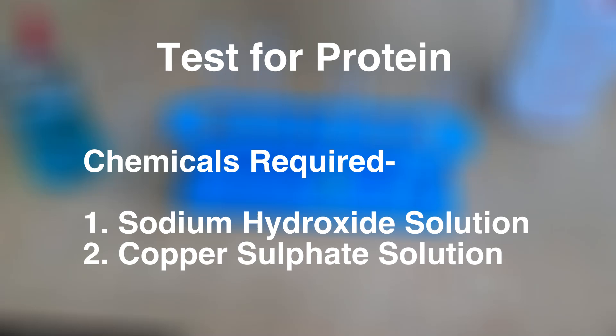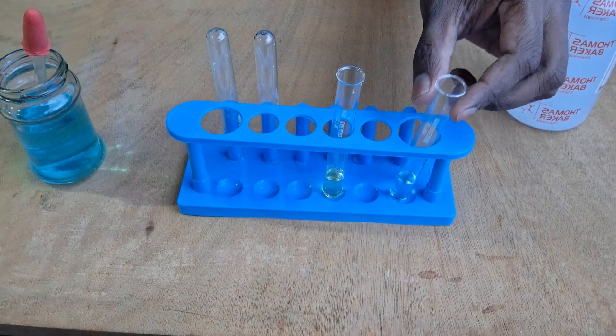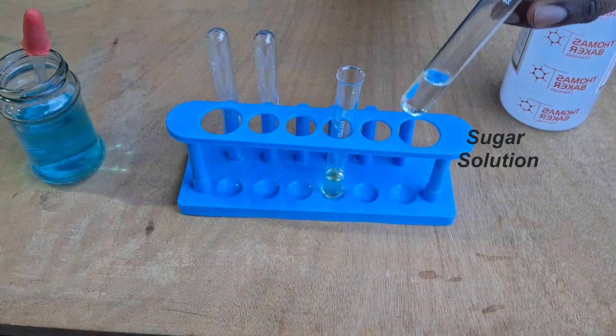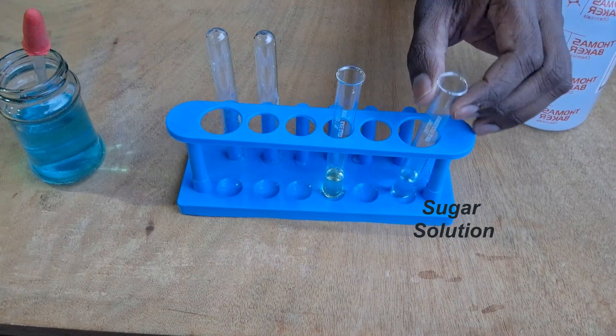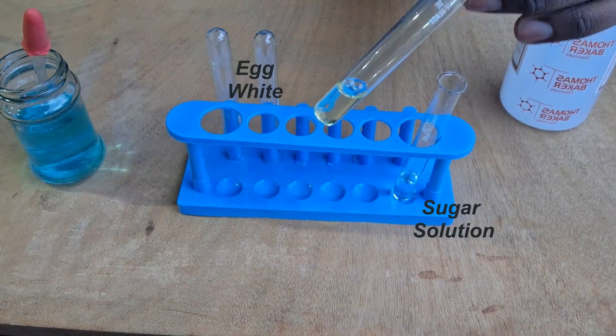In this video, we'll do a test for proteins using two chemicals: sodium hydroxide solution and copper sulfate solution. Both of these will be dilute solutions. Our first test sample is sugar solution, and the next test sample is egg whites.